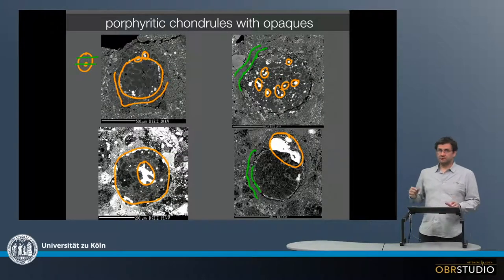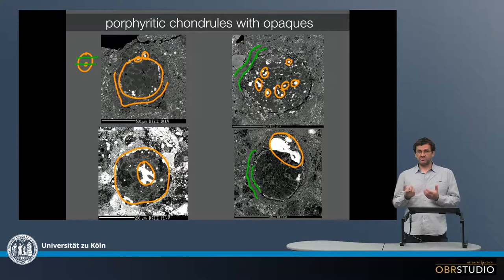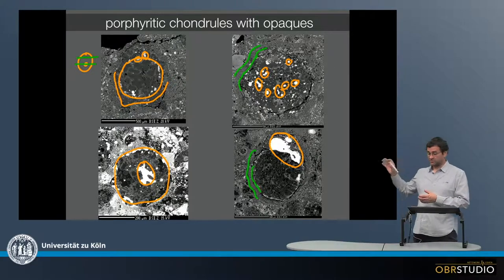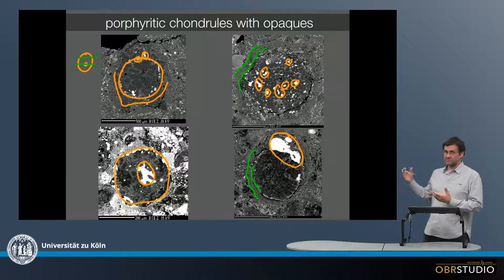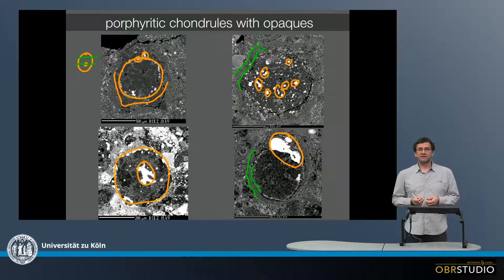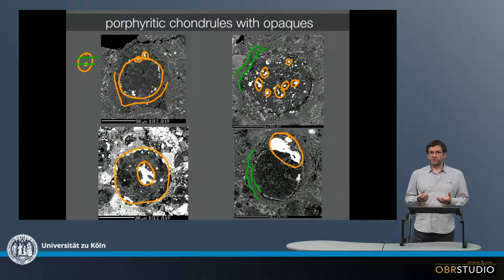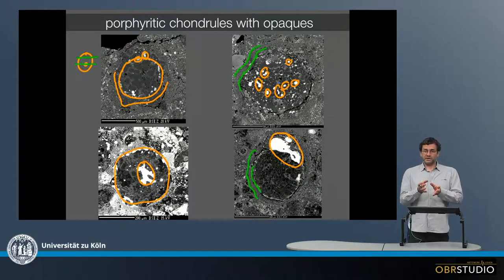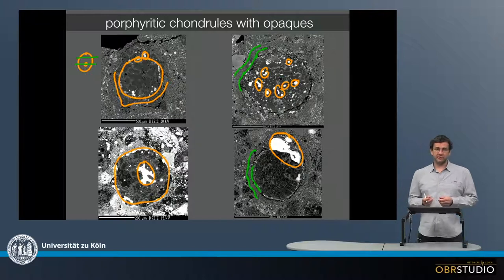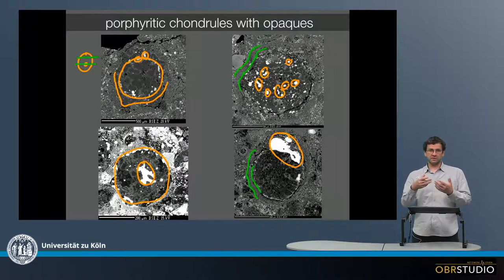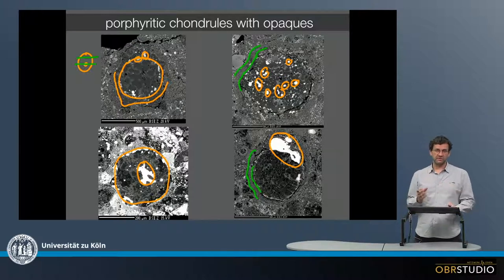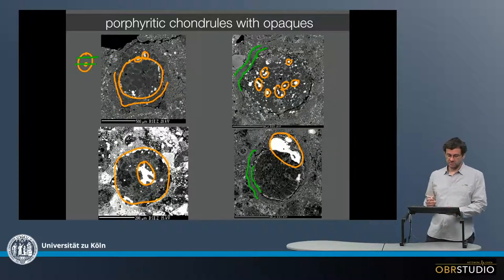The blebs of opaque phases are often quite brownish and bleb-like, likely formed when the chondrule is molten and then the silicate and the opaque phase separate like water and oil, because these are not miscible.